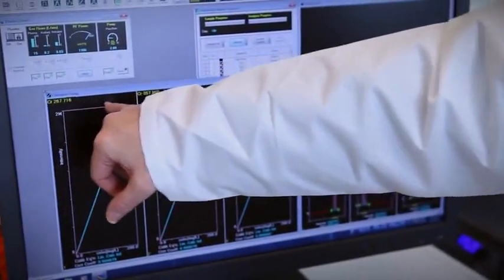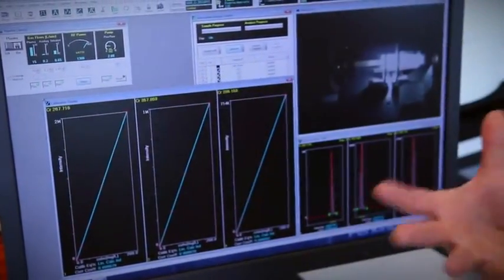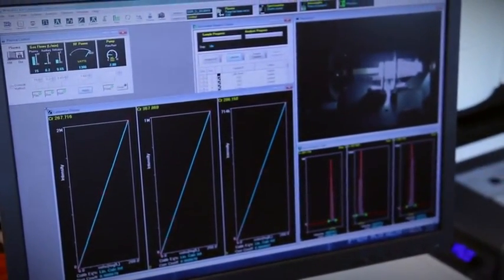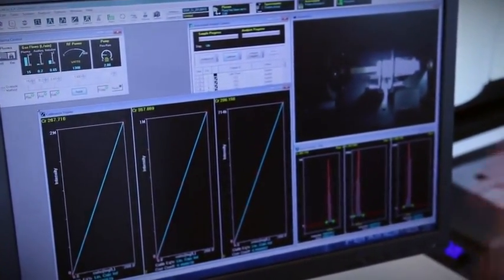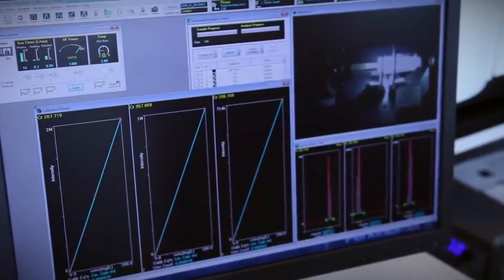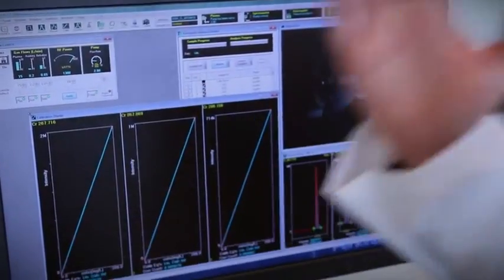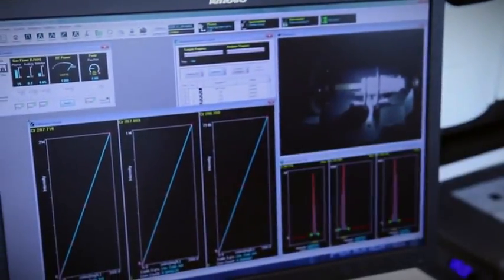So over here, for example, you tuned the spectrometer inside the OES to look only at 267 nanometers. And that's one of the characteristic fingerprint wavelengths of chromium. Only chromium will emit there. So if you have other atoms like iron or copper in your sample, you won't be detecting them if you only look at that color. And you'll notice in this graph and in this graph we're using some other wavelengths for chromium emission.